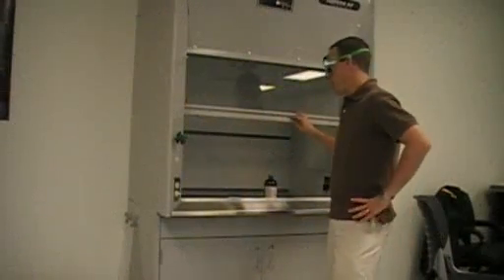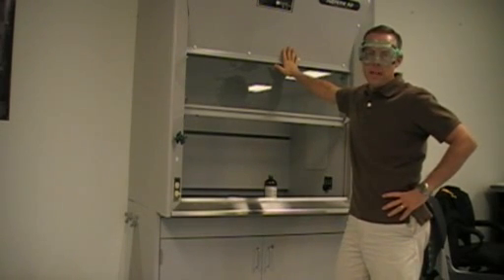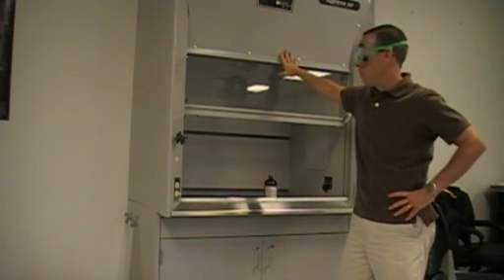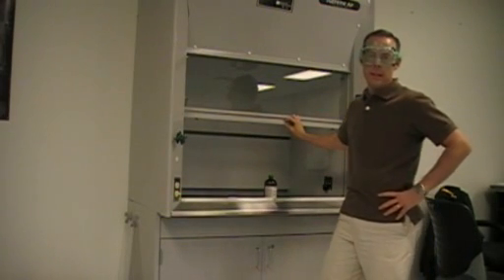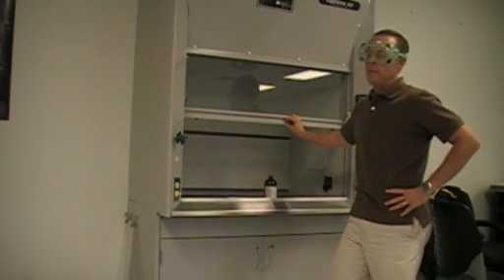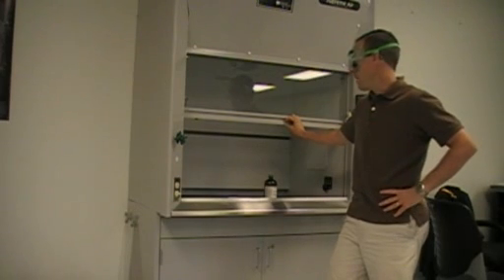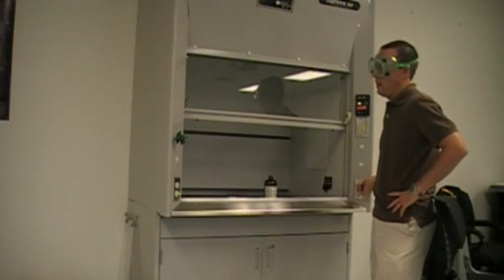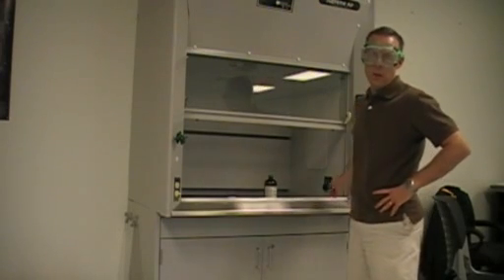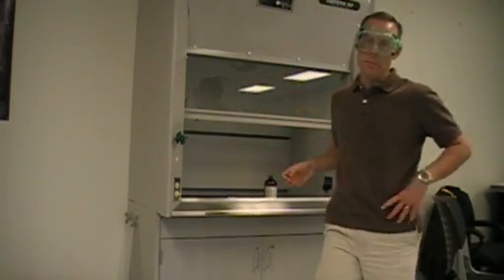This equipment is not on your quiz that you are going to be taking. This is a fume hood. We will use this maybe once throughout the year. We don't use it a whole lot. In AP chemistry, if you take college chemistry, you will use it a little more often. But if there are chemicals or reactions that make really noxious fumes, stuff that can burn you, that can burn your nose, your nasal cavities, we typically react them under the fume hood. There is a switch over here. You can hear a fan going. That will suck those fumes up and take them out of the building. So you are not exposed to them.